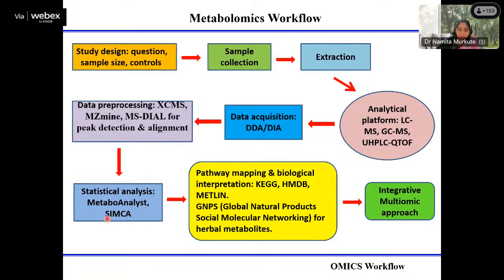SIMCA is chargeable software, but it has very good modules for PCA and PLS-DA, and you can do hierarchical clustering in it too, to identify which biomarkers have a high confidence interval or high statistical values. So this can be done in SIMCA. It can be done in MetaboAnalyst also, but that works on different algorithms.